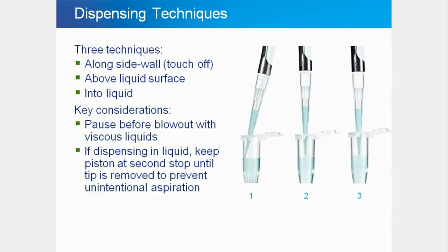At the end of the pipetting process, as the sample is being expelled, there are several options to ensure that any remaining liquid is expelled from the tip. You can combine these options. They are not mutually exclusive.